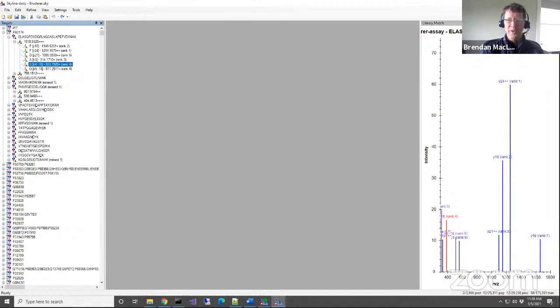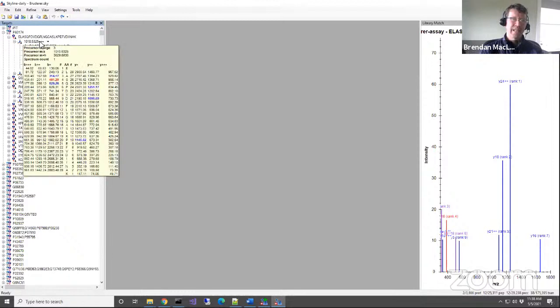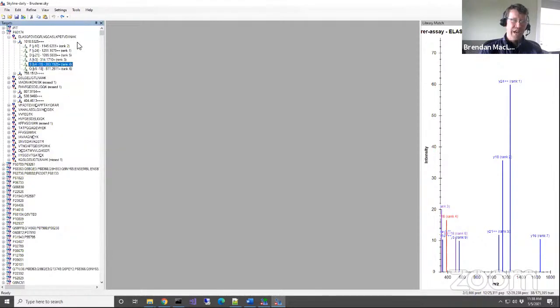If you're just counting ions that you found, then a long charge 3 peptide is going to have lots more peaks in the spectrum that match the peptide, because it can fragment in a lot more places, and it's more likely to have both charge 1 and charge 2 fragments. So that's definitely an issue for DDA search algorithms.